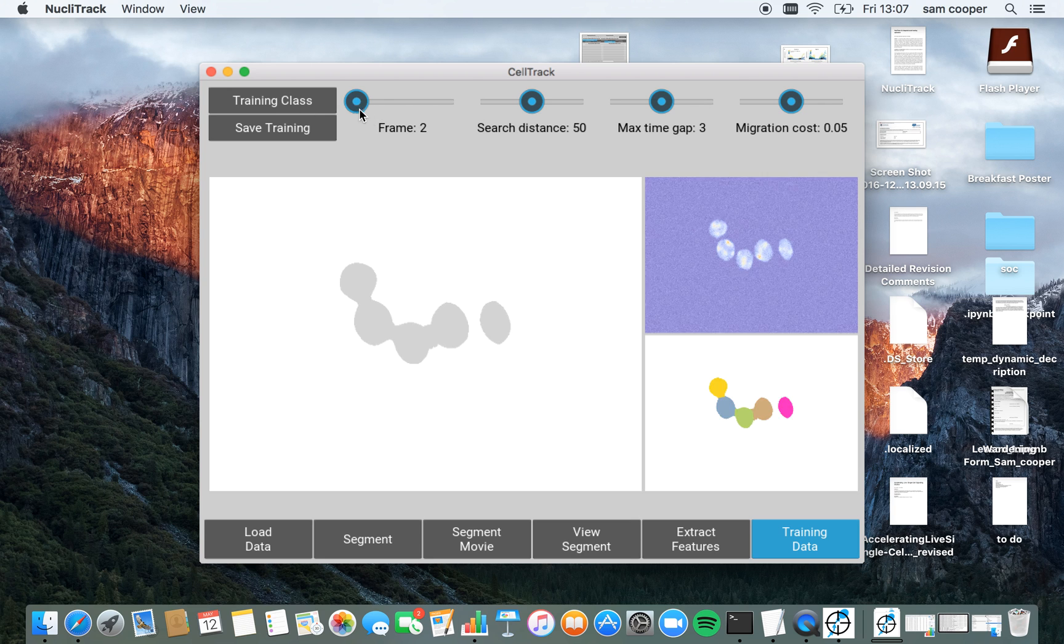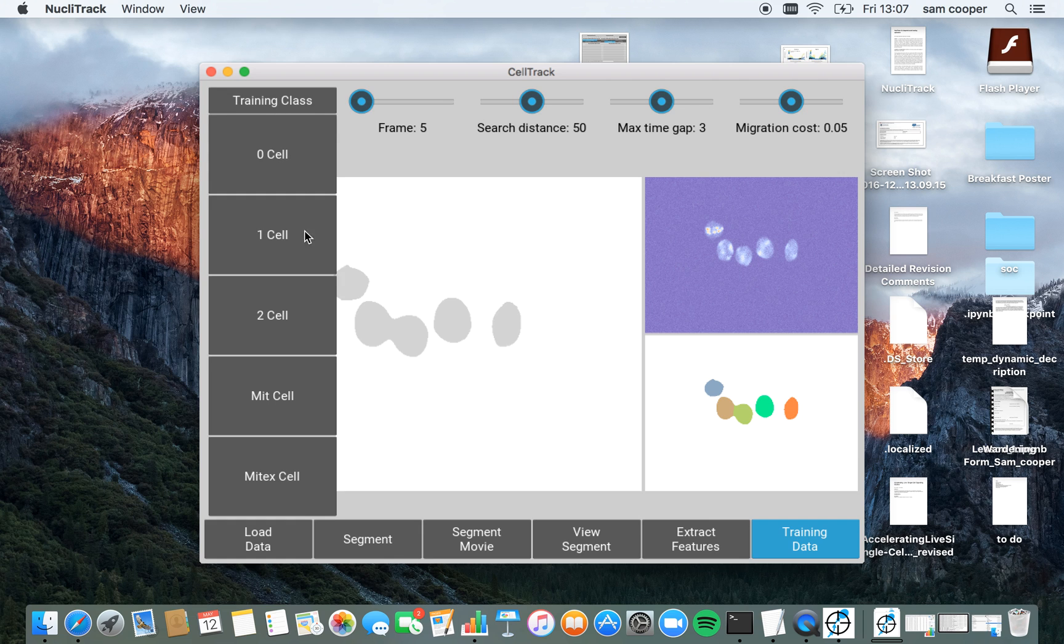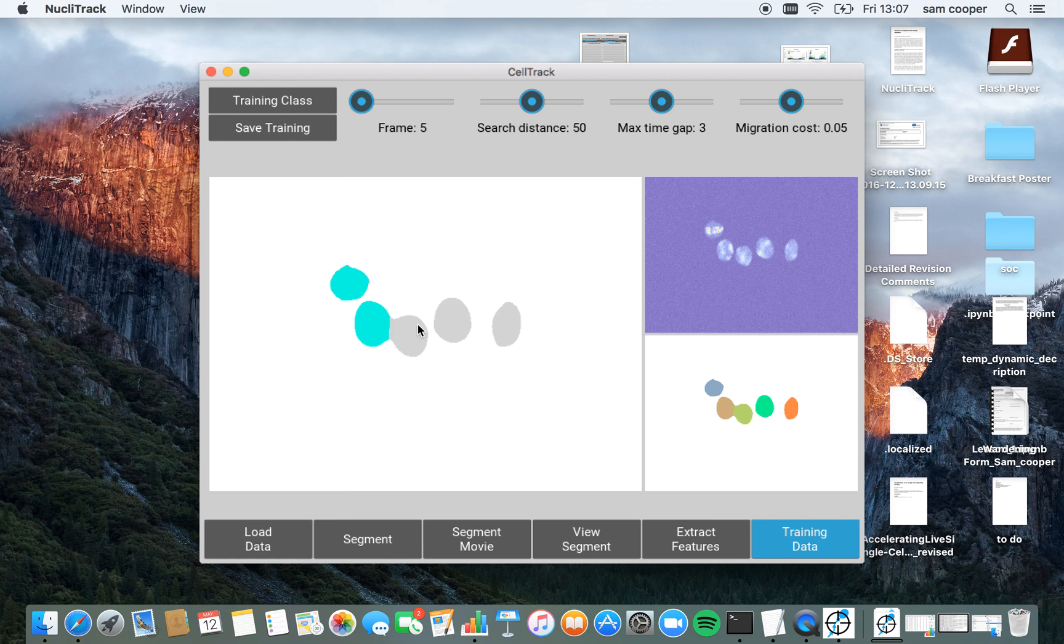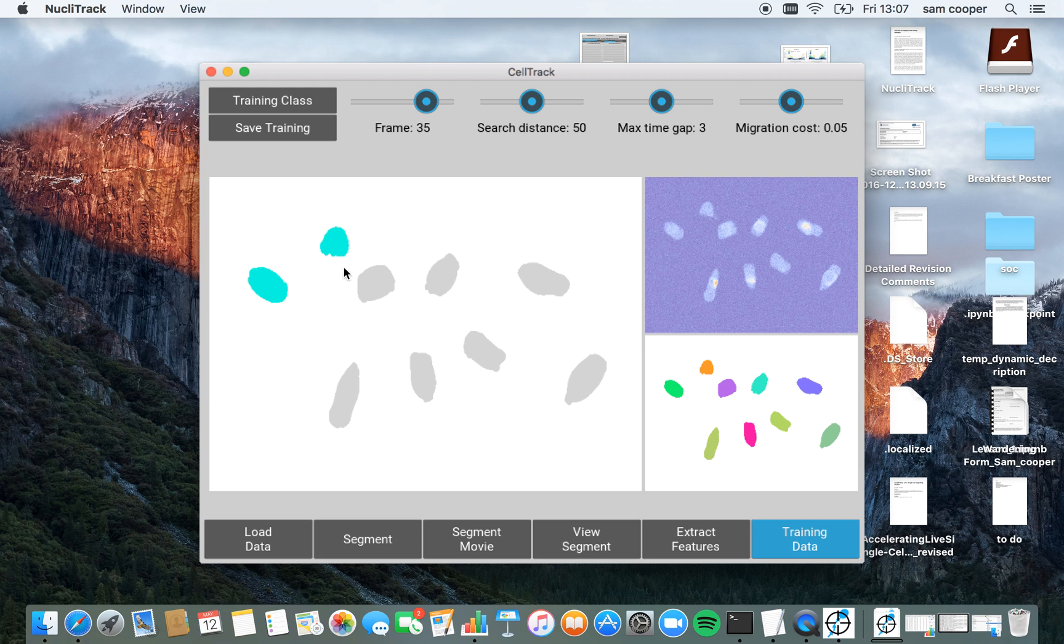NucleoTrack works on probabilistic tracking. So I now need to select examples of where we have different types of cell segments. So the majority of segments contain a single cell, which I'm now highlighting here.